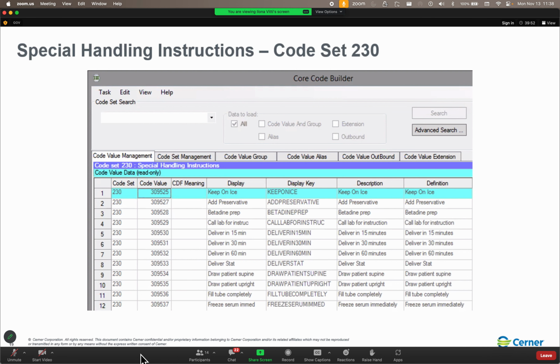Now, just as a heads up, when you come in to the add collection parameters and you are adding in a new container, it defaults to aliquot container no, and you don't even see that question. So you have to drag the window open just a little bit to be able to see that last question. Because most of the time you're not building aliquots. So I guess that's the reason that the engineers decided to code it that way. So any questions on our containers?